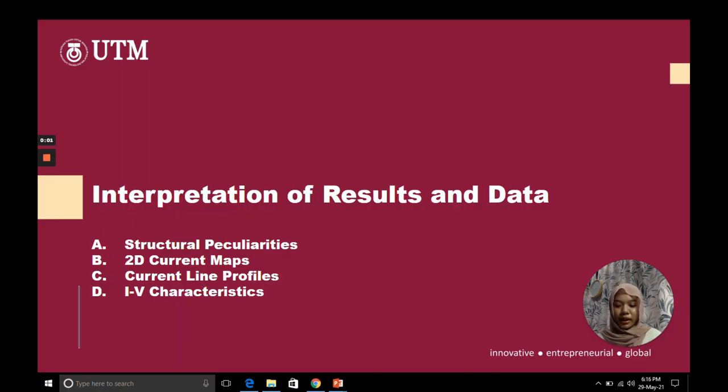Thank you, Zara. Hi and a very good day to everyone. My name is Nurul Damia bin Jiraswadi from 4SSCF. I will be continuing presenting on the CAFM. Firstly, I will be presenting on the interpretation of results and data, which consists of four things: structural peculiarities, 2D current maps, current line profiles, and IV characteristics.